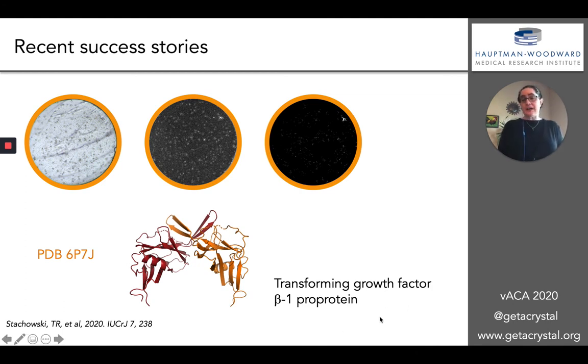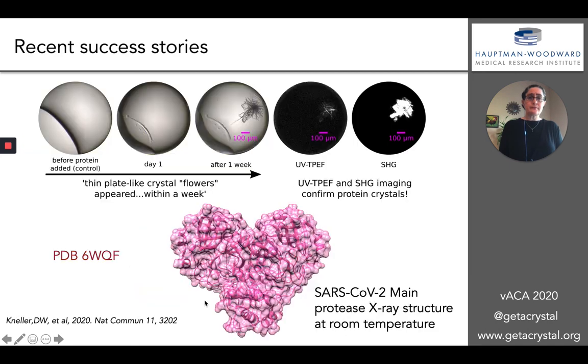This is from the Snell lab. Tim Stokowski is a soon-to-be graduated PhD student from Roswell Park Comprehensive Cancer Center, and he might recognize these two images from earlier. These particular, again, in this bright field image, you might not pick out this as a crystal, but this is the condition that ended up being the initial crystallization hit that was optimized to enable Tim to solve this structure.